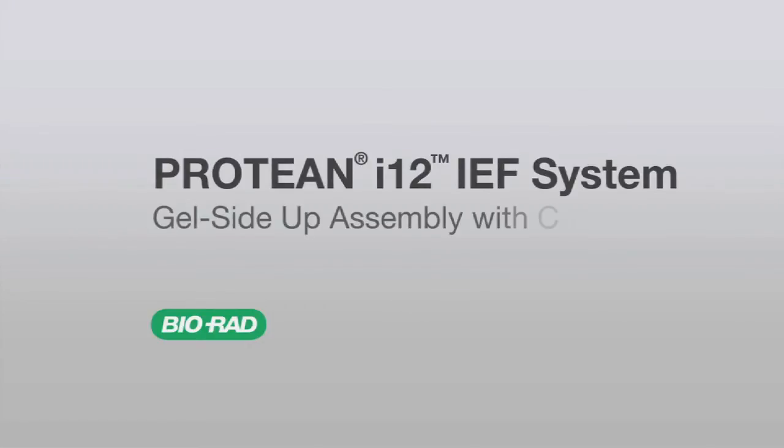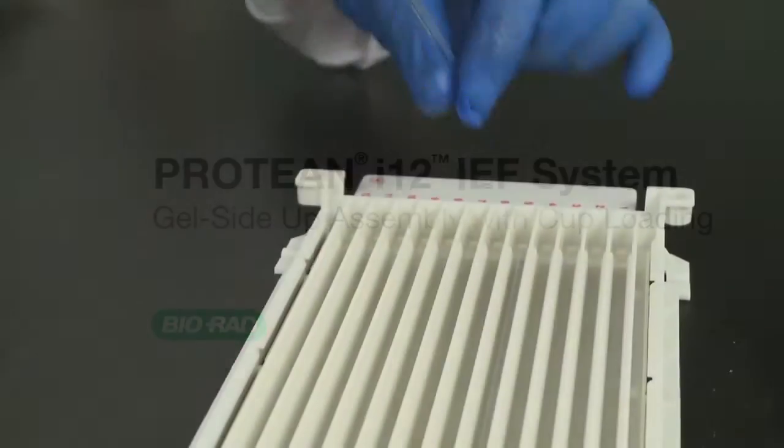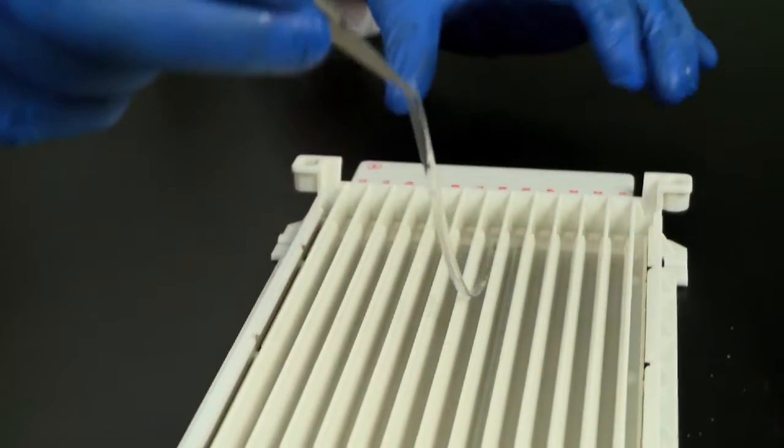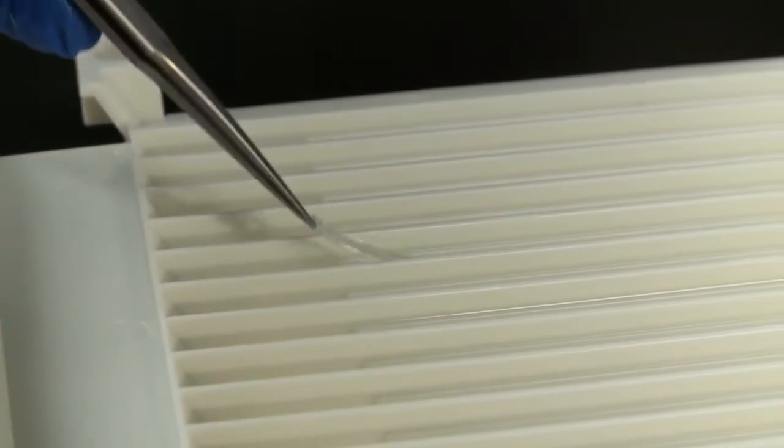To use sample loading cups with the PROTEAN i12, follow this setup procedure. First, place the rehydrated IPG strip gel side up in the focusing tray.